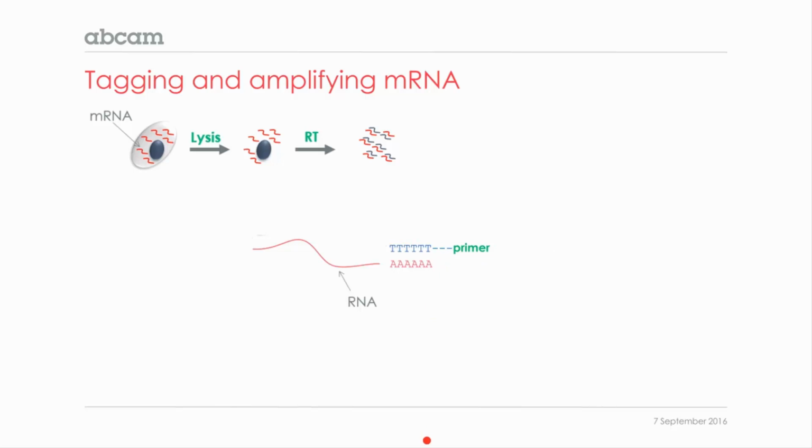Then what happened is that the reverse transcriptase started to copy the RNA, and when it gets to the end, this family of reverse transcriptase enzymes, MMLV, usually tends to add 3 nucleotides at the end of the molecule, and they are with high tendency CCC.